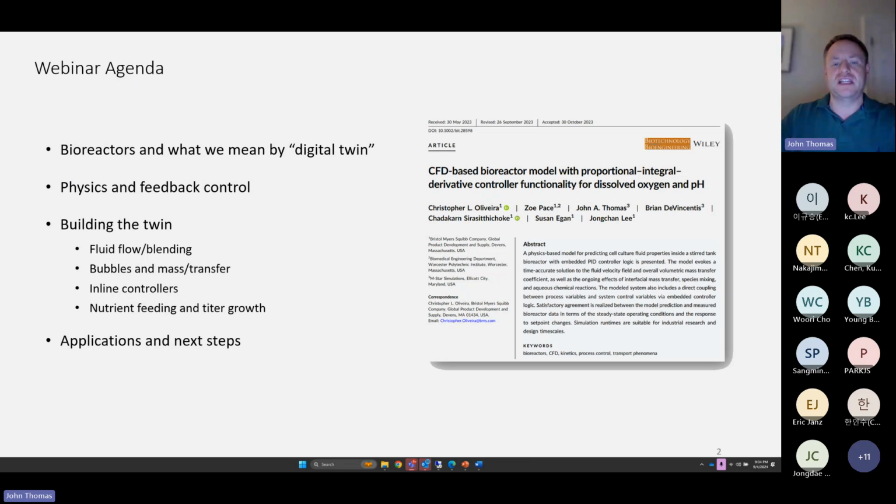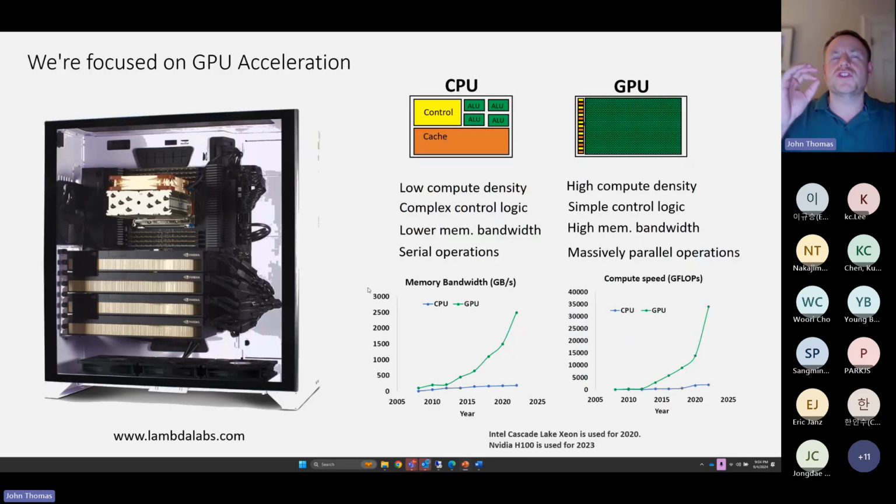So I think we've delayed enough. Let's get into the agenda. At MStar, we are strongly focused, and this will motivate much of what I'm going to be speaking about today, on GPU-based simulations, okay? All simulations that we'll be running today are designed and tailored to run in GPU environments. And I'm making this the most important point and the starting point because this is what makes all the simulations possible. I'm going to be showing you things today in terms of modeling time-dependent three-dimensional flow fields over very large timescales in practical terms, over many days of simulated processes in a very short simulation timescale that is using fast-running simulations. And what's making this possible, again, is our GPUs.